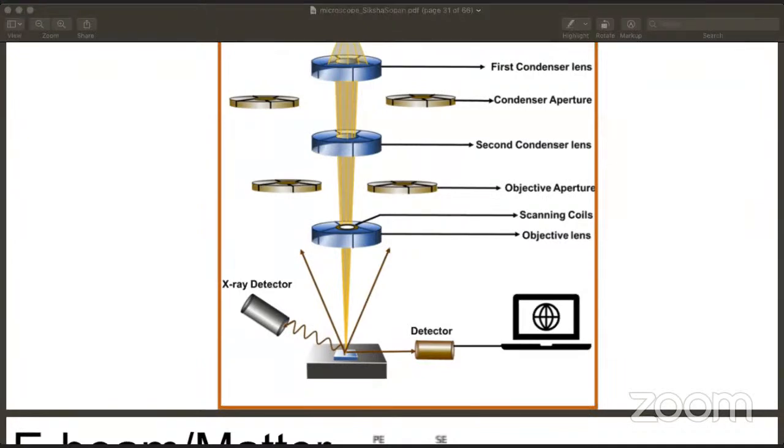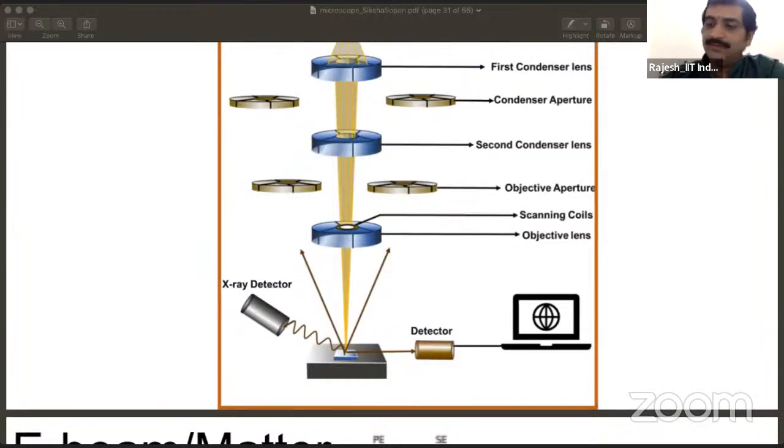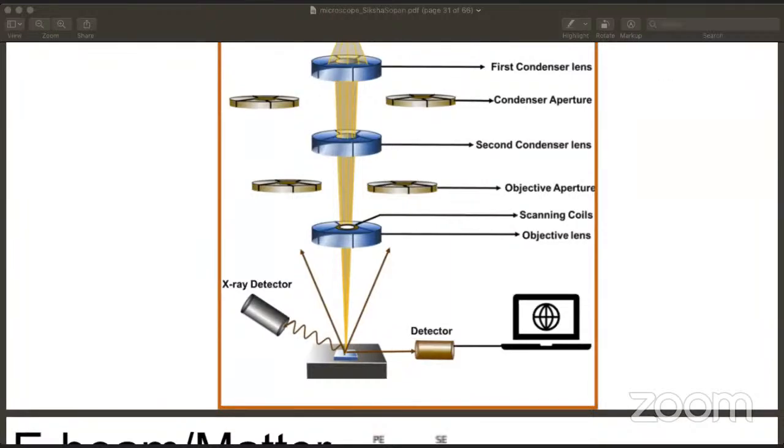Excuse me, sir, I had a doubt. Can I ask it? Yes, please, Kunal. If I know, I'll answer. Sir, the doubt was, in the AFM you mentioned, it has a needle-like aperture there. If that whole area is to be determined, how is its morphology determined with that single needle?